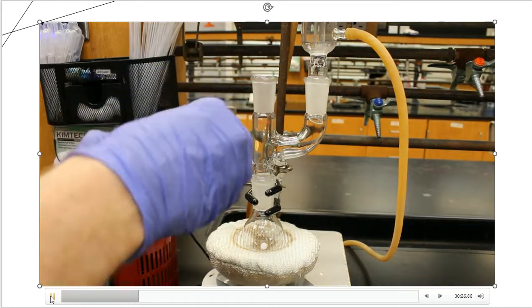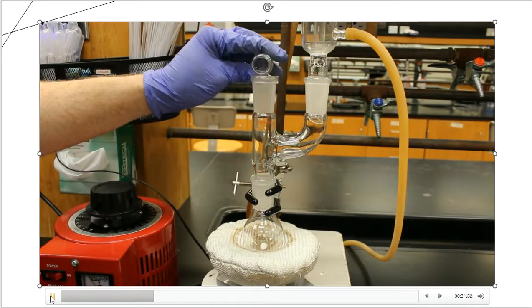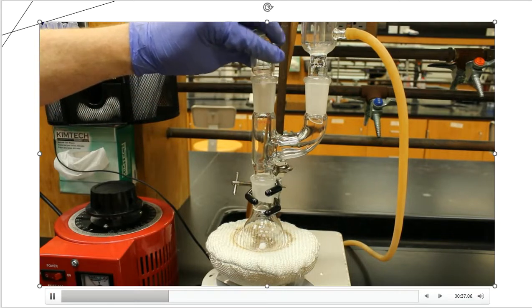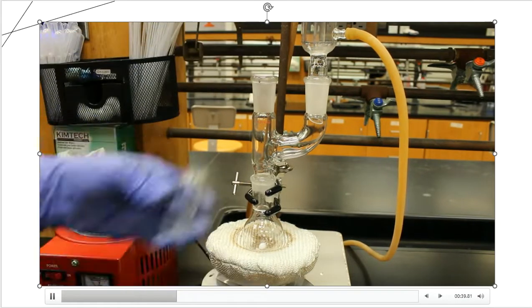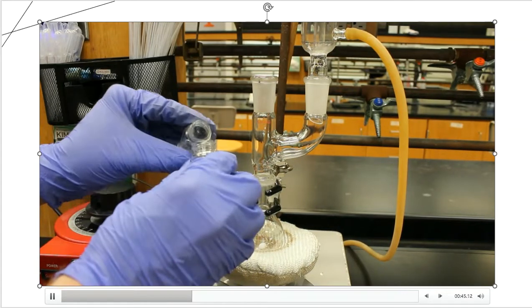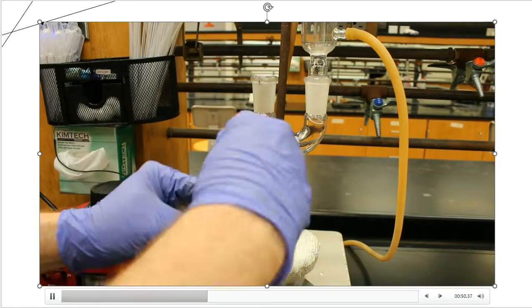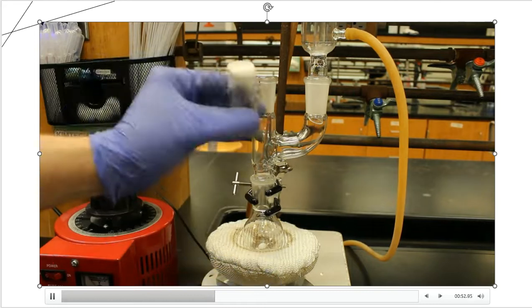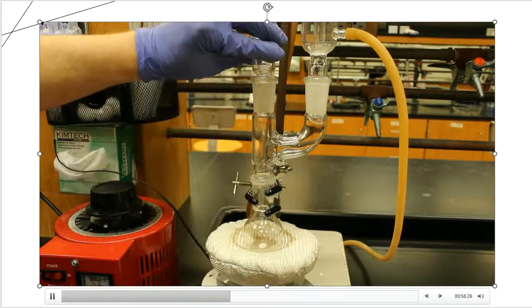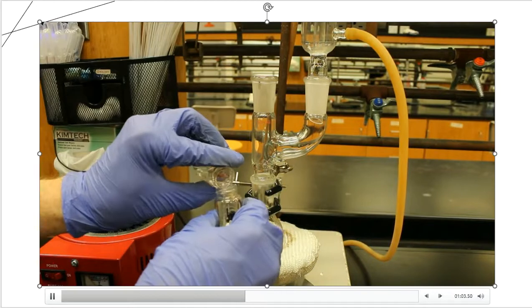And I'm going to add a little bit of the anisole, actually all of the anisole, to the boiling flask through the separatory funnel joint. So I'm just going to allow it to drip down in there. A little over 1 gram is what we used. I want to make sure I get all of that out of there. So what I'm going to do is add a little bit of the methylene chloride into that container. I'm going to put this back on and give it a shake. The reason for that is I want all of the anisole out of that container. I don't want to lose any product yield right here. So this is actually going to be the best way to do it.